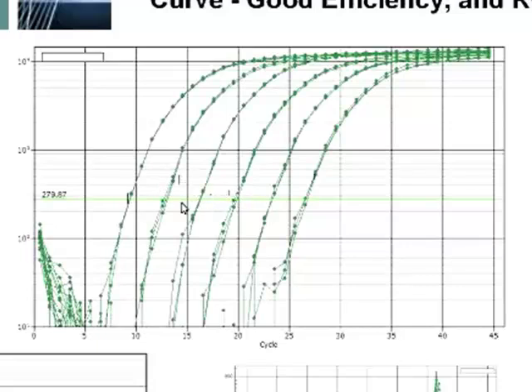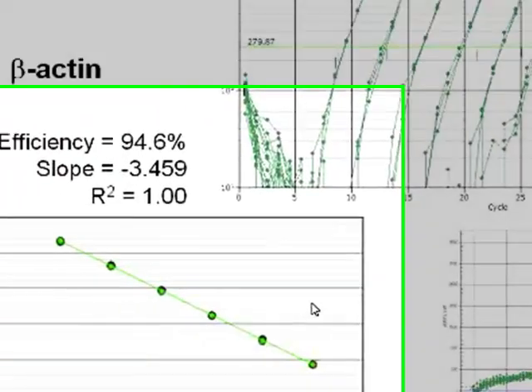And if they come up below 18 CTs, I would recommend doing an 8-fold serial dilution series, and doing an 8-point standard curve in triplicate at each point. So what will happen is you will get a nice standard curve using that same pooled cDNA sample for all the primer pairs, except in different serial dilutions depending on the expression level of the primers.